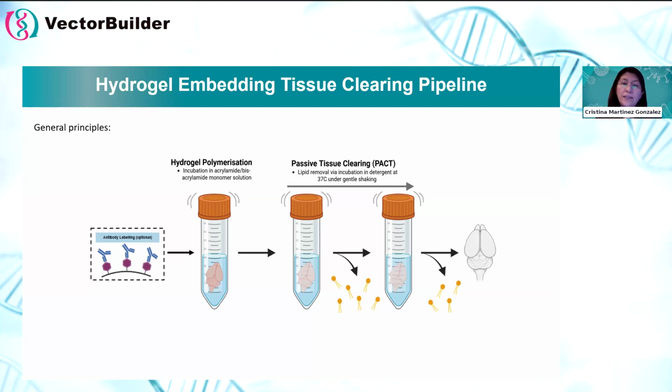And there are ways to increase that with electricity. Basically, they base it on the concept of making a Western blot gel, because the tissue is embedded in acrylamide. If you pass electrical current, you can remove not just the lipids with the soap, but you remove some of the proteins and speed up the process. Unfortunately, if you remove your proteins with electricity and you try to see something in there, you will lose your proteins. So it's basically making your brain a huge Western blot gel.